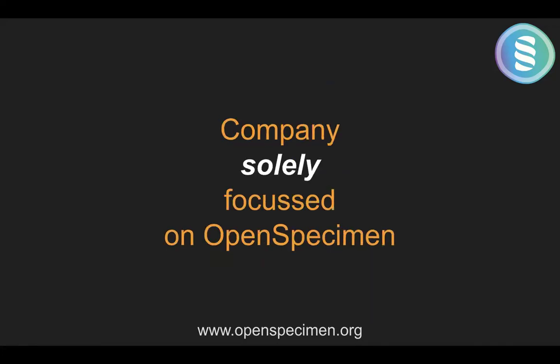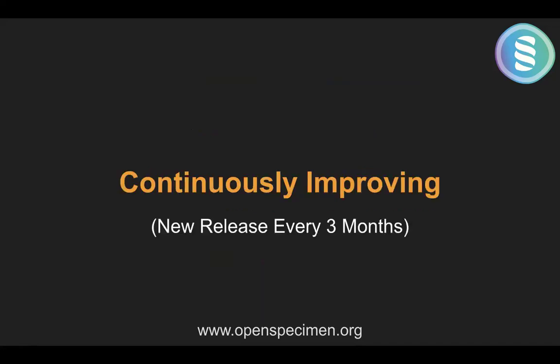We as a company are solely focused on OpenSpecimen, so that enables us to improve the product rapidly, listen to customer feedback, keep making improvements, and also provide customer support. We make new releases every 3 to 4 months with new features, bug fixes, improvements, etc.